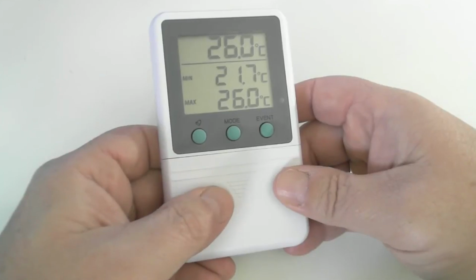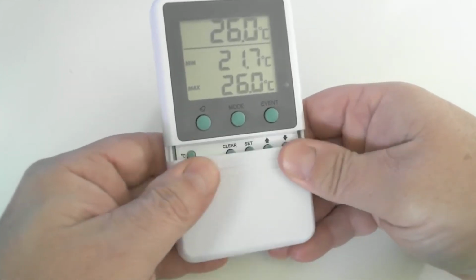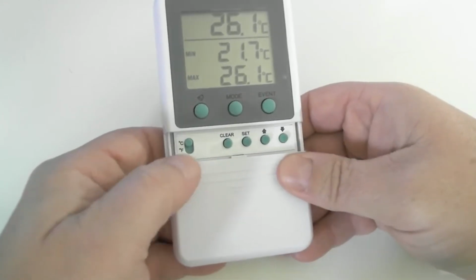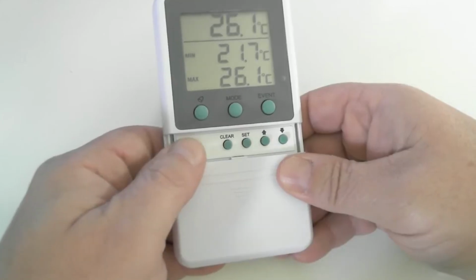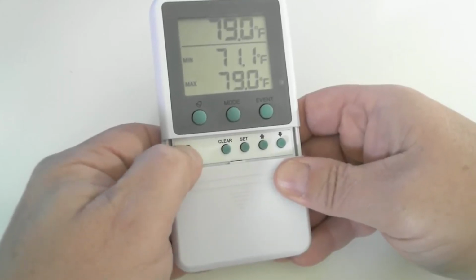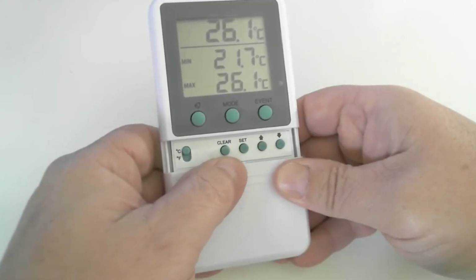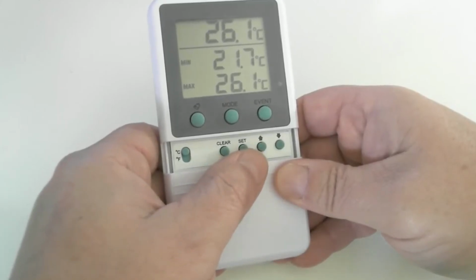Okay, quick overview of the ACC821. Sliding the front cover down will give you access to additional controls and settings. On the far left, we have a selection switch for either the Celsius or Fahrenheit temperature scale. Next, we have a clear button to remove all data from memory. Next, we have the set button for time, date, and alarm set points with up and down navigation buttons to make those settings.